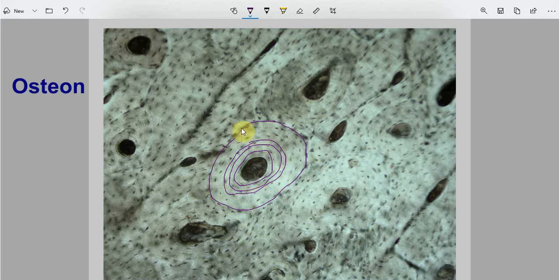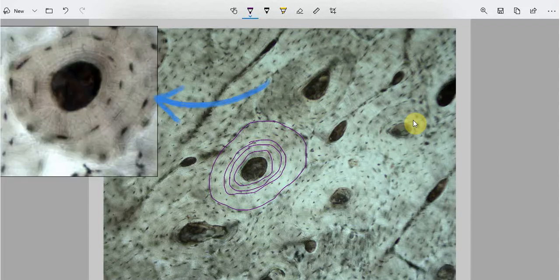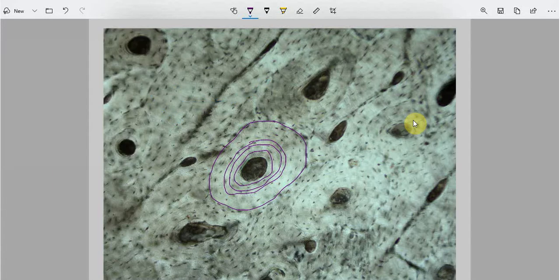This complete set of concentric lamellae is known as an osteon. This is one osteon, this is another osteon. Let me show you a single osteon on higher magnification. This osteon is also known as the Haversian system.